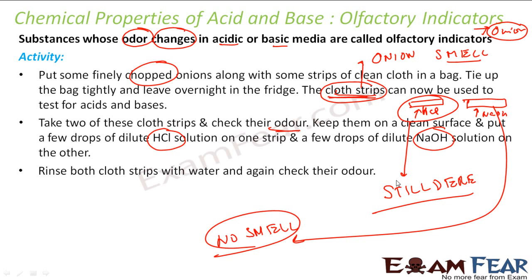There is no smell in the base one, that is the sodium hydroxide one, and there is smell in hydrochloric. So I took hydrochloric acid and sodium hydroxide.